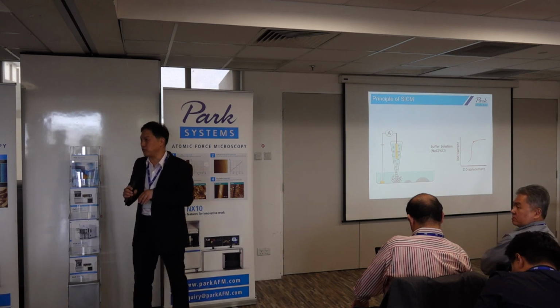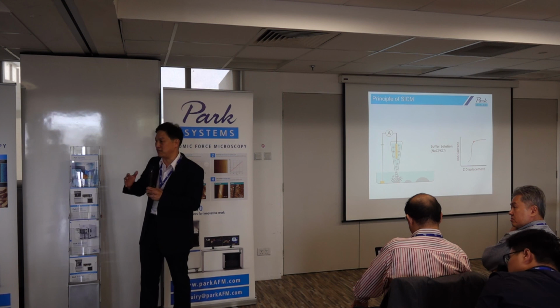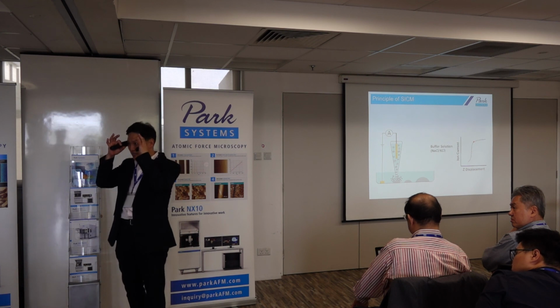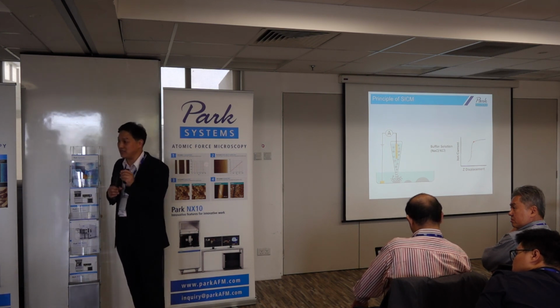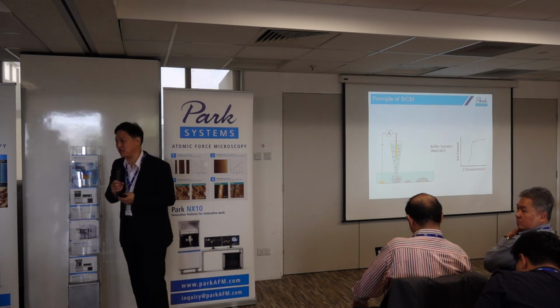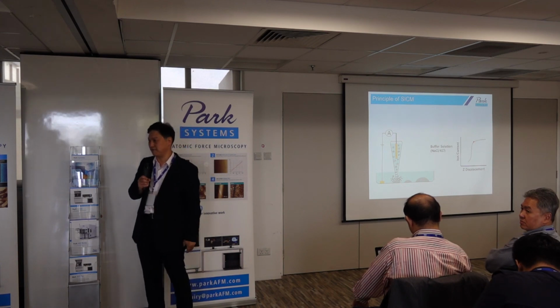Right now we are collaborating with A company and M company. They are developing these lenses, and those lens materials have really tiny nanostructures, so they came to us to measure those structures. So yes, this AFM can be used, especially in non-contact mode, on those structures. Thank you. You're welcome.